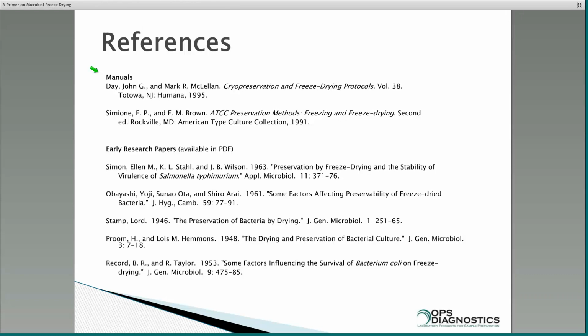And let's see, next question. I read that in your microbial freeze-drying buffer, you suggest equal volume. How feasible would it be if, which is that, one what? Oh, if I am to grow cells in 6-liter volume. Ooh.